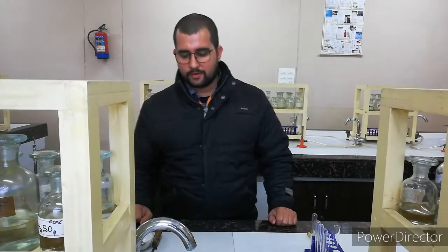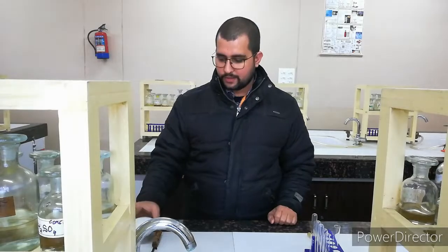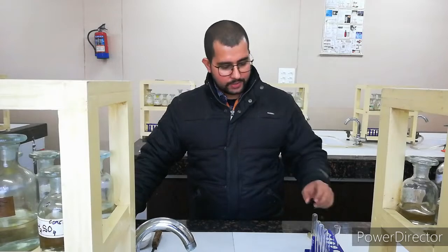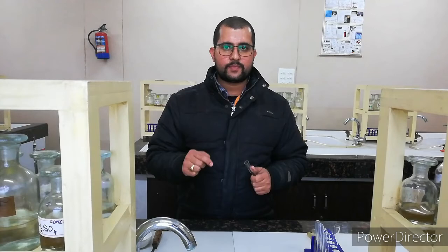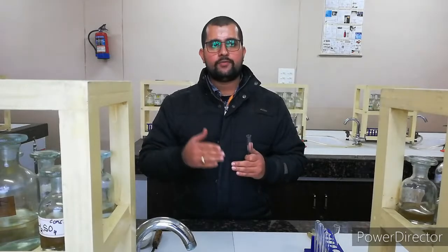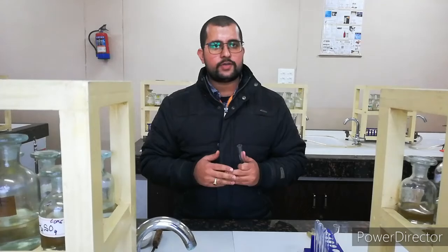Students, I am here with another sample of the fourth group, and first we will examine it to find out one cation and one anion. For proceeding, we will start with the anion test, first with dilute H2SO4 and observe what is happening, then we will proceed to concentrated H2SO4, and if I still do not get anything, then we will move to the sulfate and phosphate test.